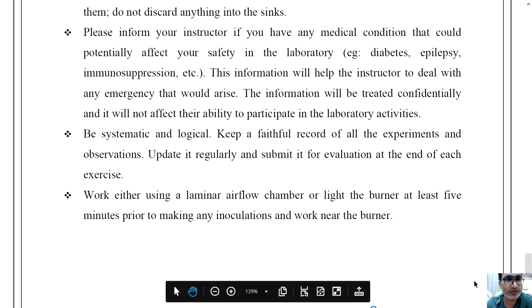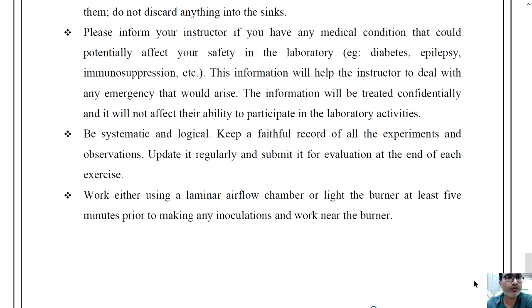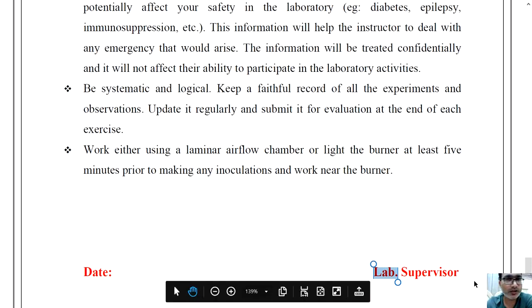Please inform your instructor if you have any medical conditions that could potentially affect your safety in the lab, such as diabetes, epilepsy, or immunosuppression. This information will help the instructor deal with any emergency that may arise.